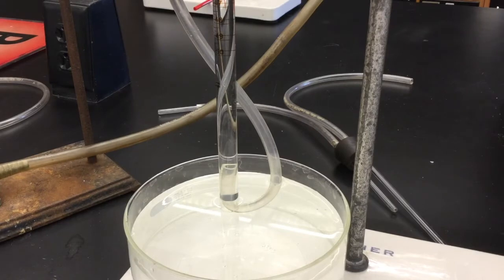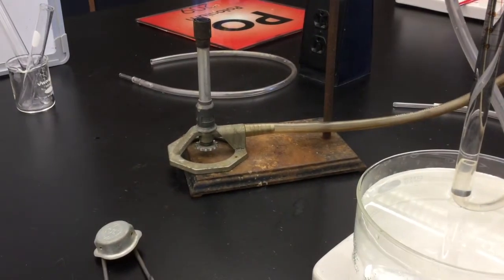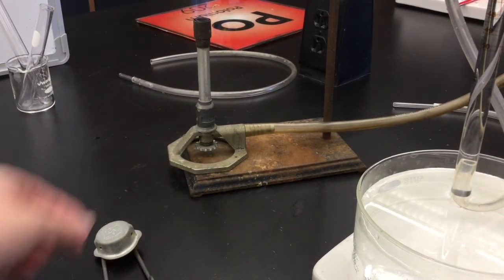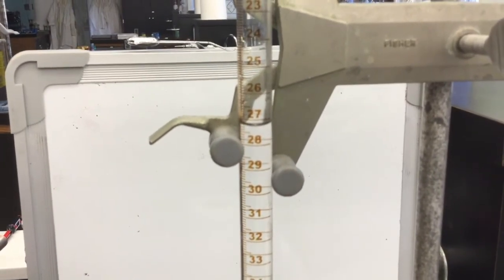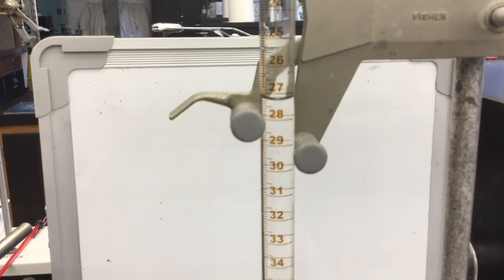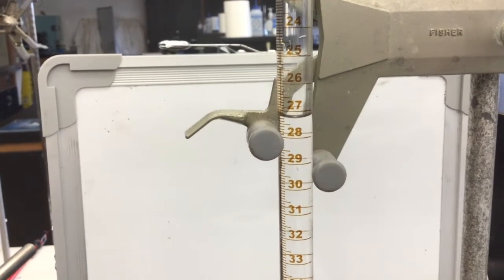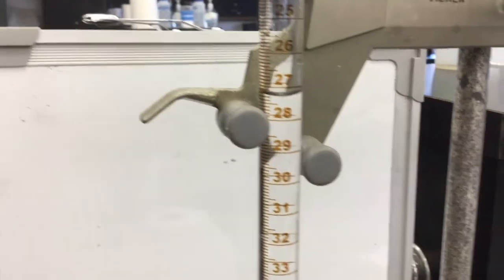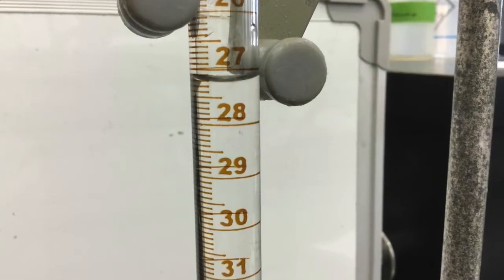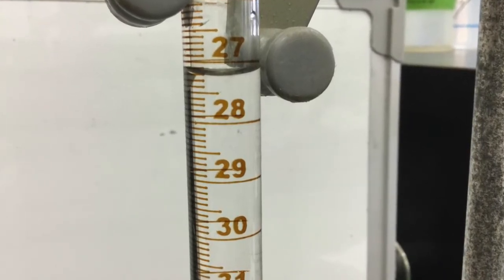Once you have no new bubbles forming, turn off your Bunsen burner, both at the burner and at the gas source. You will again need to take a reading of the eudiometer. Make sure that you're reading it at eye level. So in most cases, you will need to bend down a little bit to make sure you are reading it properly. And you may need to adjust the eudiometer so that the clamp is not hindering your ability to read it.